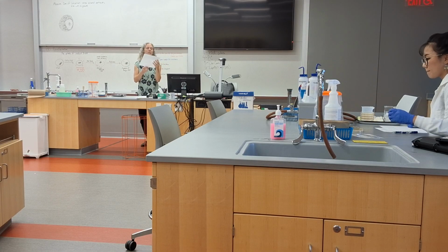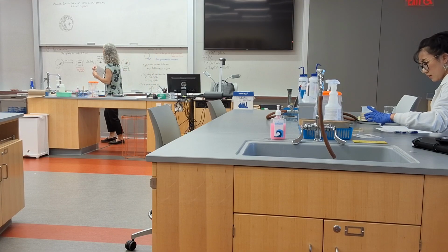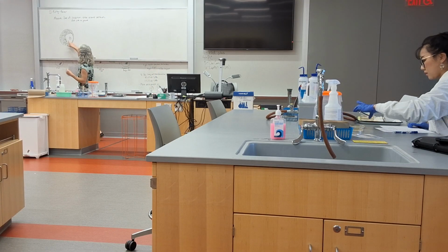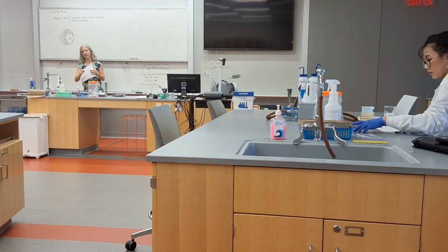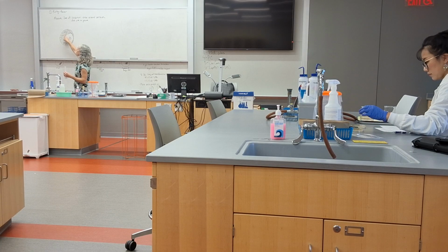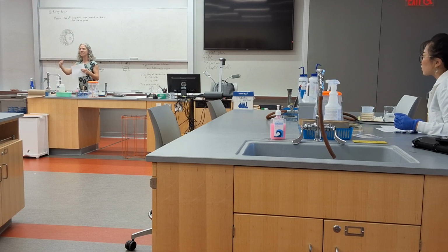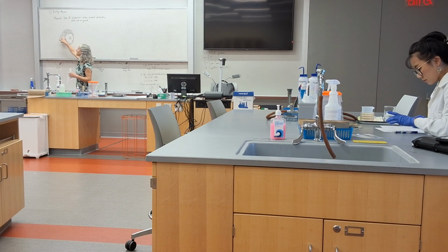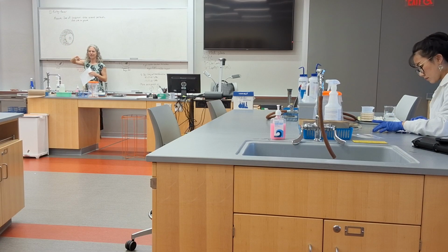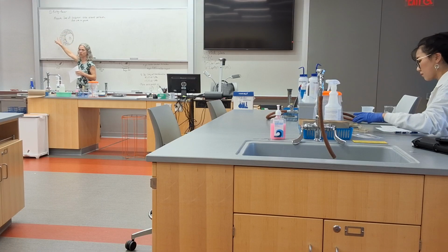Now, what you want to do is use your ruler, and we're measuring in millimeters. We want to measure the zone of inhibition, this area of no growth around the antibiotic disc. Sometimes the growth goes right up to the disc, sometimes even over the disc. In that case, clearly that antibiotic has no effect. So we can say that this bacteria, this is E. coli, we could say E. coli is resistant to antibiotic A. That antibiotic has no effect on preventing its growth. It's resistant.